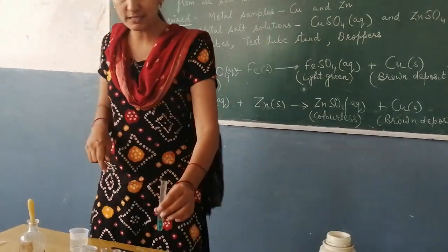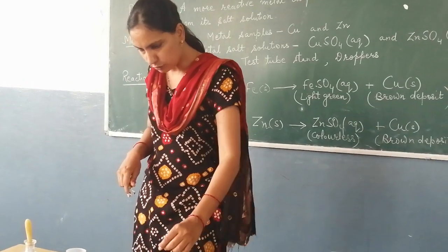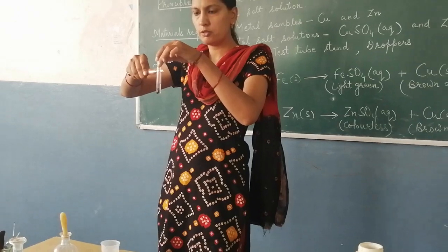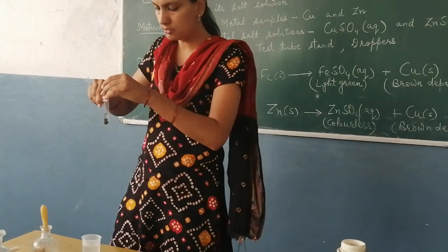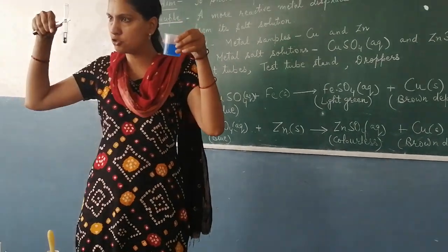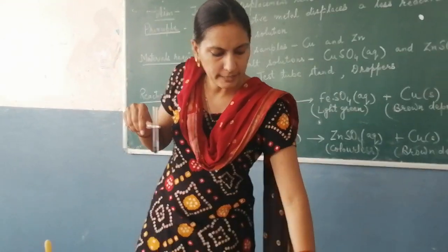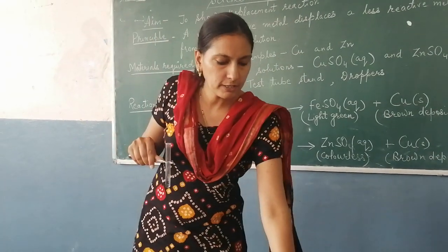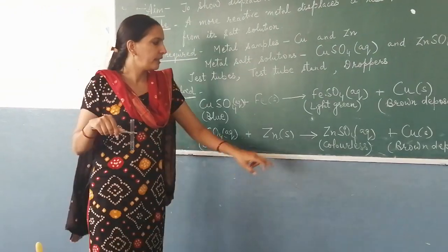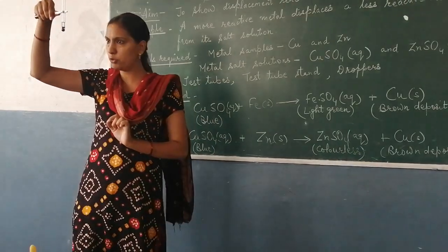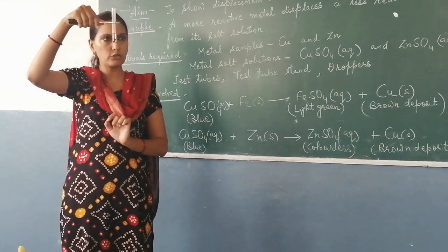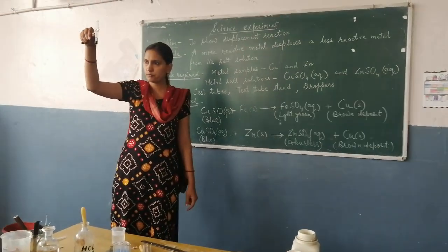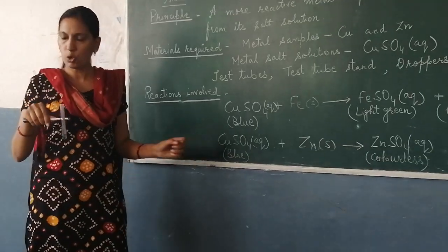Next, we will perform this activity with zinc. I have taken copper sulfate solution in this test tube. I take some zinc granules and put them in this test tube. After some time, we will see that the zinc sulfate will be colorless from blue. It is a colorless solution, and we can see the brown deposit in the test tube. This is the second equation.